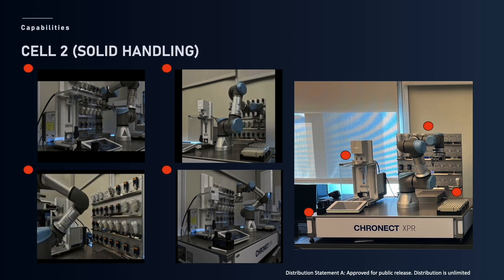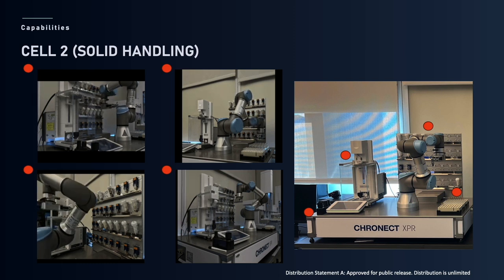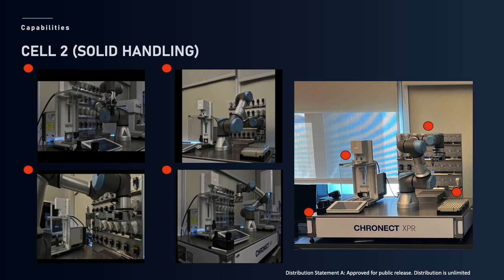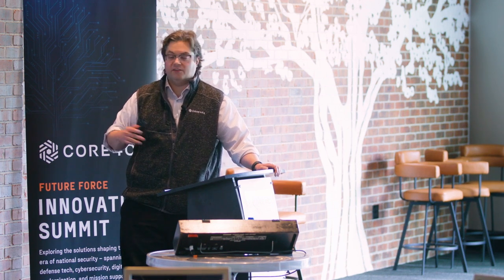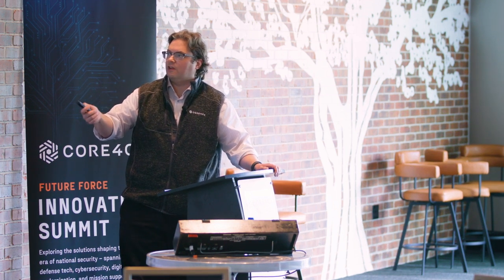When the dosing heads are placed in position above a vial, the balance will actually lower the dosing head to a preset distance from the vial and start dispensing solid material. The neat thing about these is that each dosing head has an RFID chip built into it, and they are stored on an RFID chip reader. So we can actually monitor the position of each chemical without telling the system where it is, and it will keep track of how much is in there and the general chemical properties of what's in the dosing head.